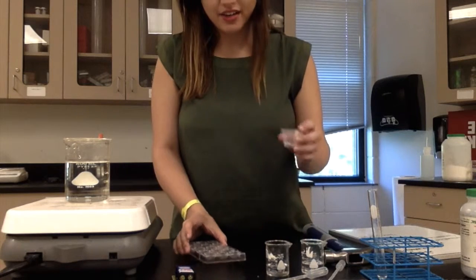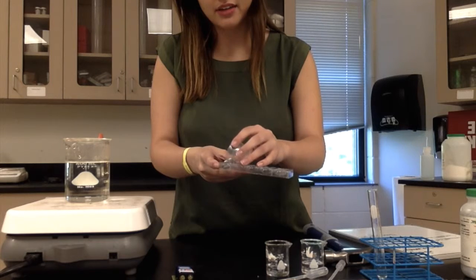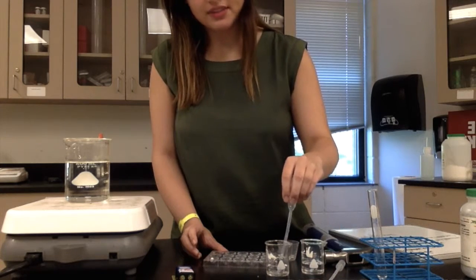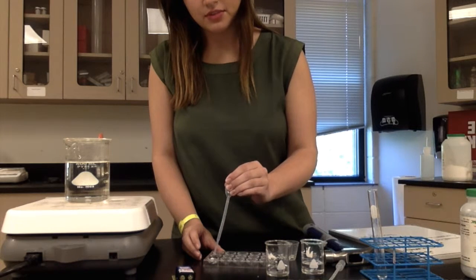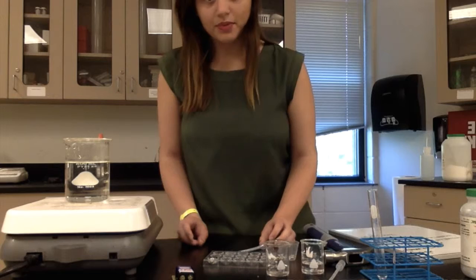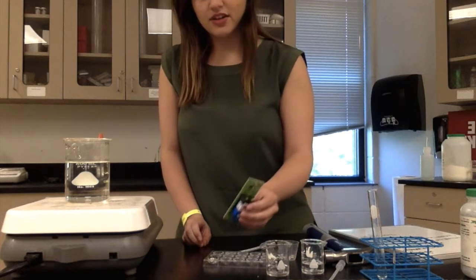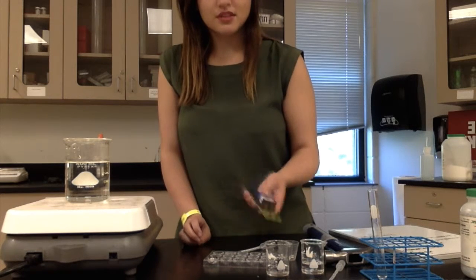And now you take another small sample of your substance and put it into a reaction plate. And then you take a pipette and add 20 drops of distilled water to record the solubility of your substance in water. And aluminum is not soluble in water, but if the substance you're testing is, then you take the conductivity tester and place it into the solution to determine if the solution conducts electricity.